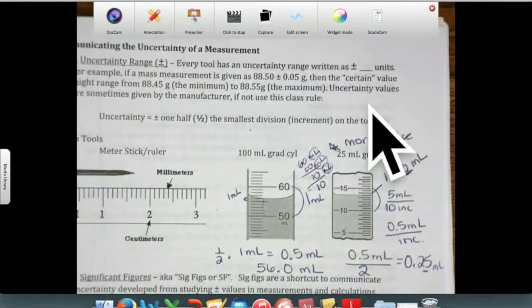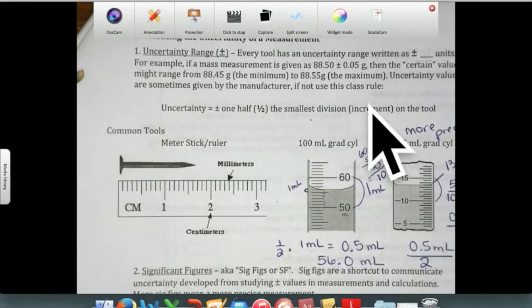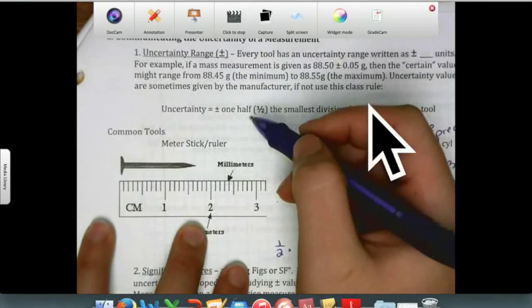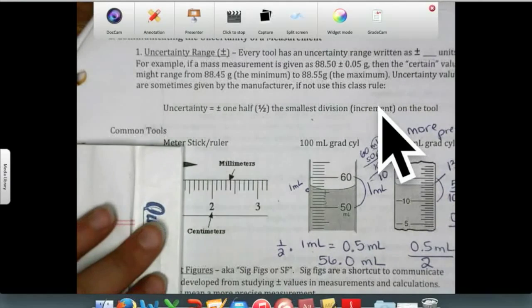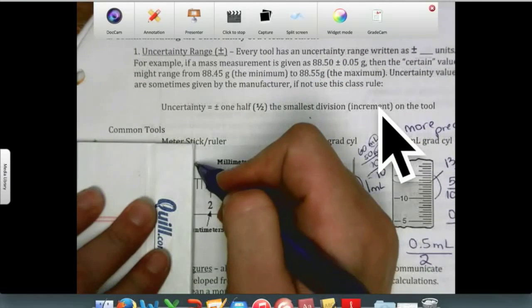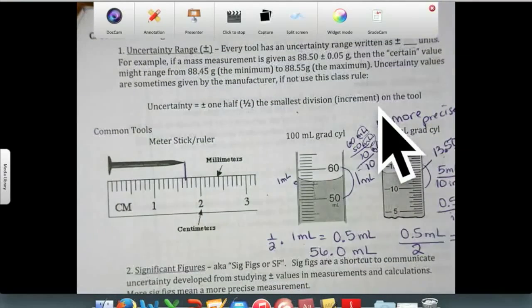We're going to go ahead and look at this ruler now. So we have this nail, and we're just going to take any object and we're going to use it as a straight edge so that we make sure that we're getting our edge right where it needs to be. So we're going to take this, we're going to drop it right down to the ruler so you can see where that ends.